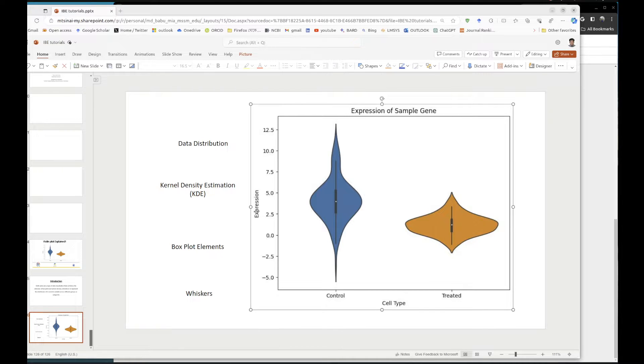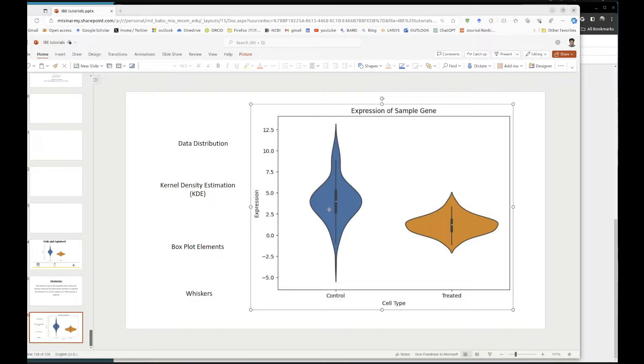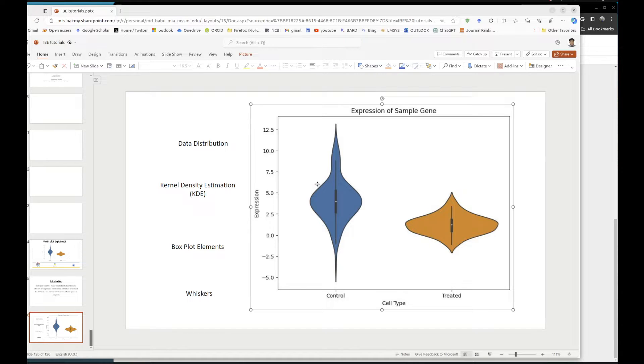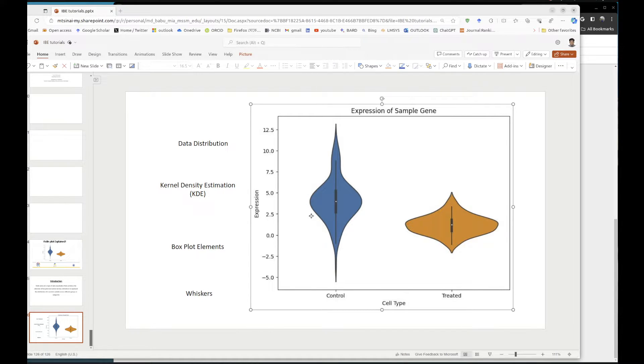You can see on this side, this is the expression level, and here we have the representation of the cells. For example, in here you have higher number of cells which is expressing this specific gene.